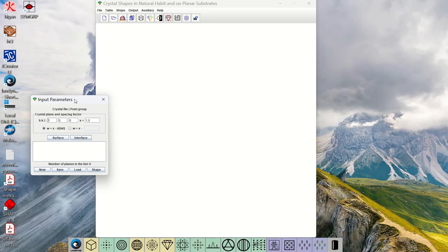You can save more complicated shapes and come back to them later. Just make sure the shape file matches the crystal structure you used. If you want to get a start or want a quick look, here is a ready-to-go example for you to look at.